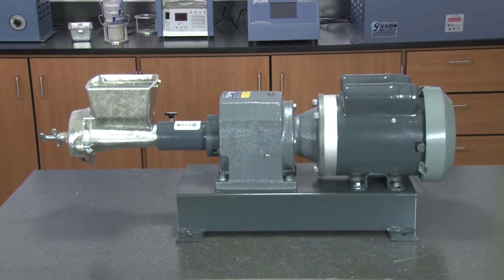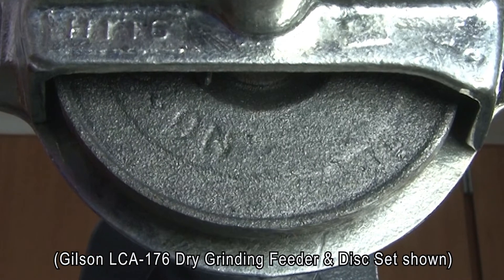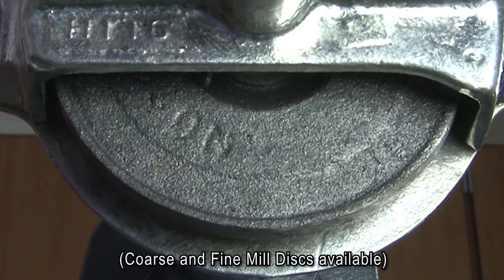This rugged mill's four inch grinding plates are made of hard iron alloy, designed for clog resistance and a long service life.